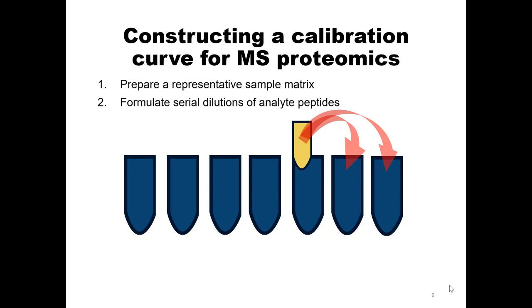One example of when you might want to do that is in a calibration curve. If you're making what is maybe most commonly called a reverse curve, I don't know if it has a more formal name than reverse curve, the endogenous level of your peptide might be present in this matrix, but what you can control for is the different concentrations of the heavy. So that might be a situation where your light is fixed, but your heavy is changing, so you might want to normalize to the light in that situation. That was a pretty intuitive question that I wanted to address.